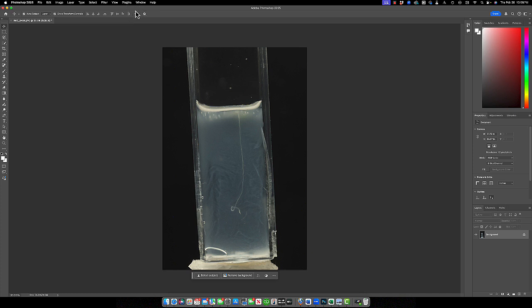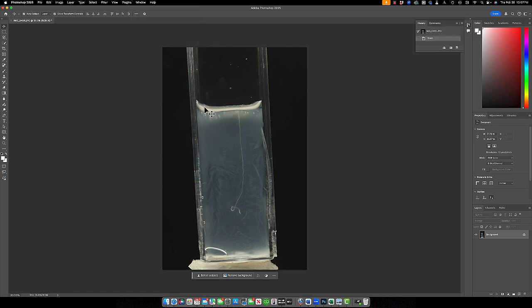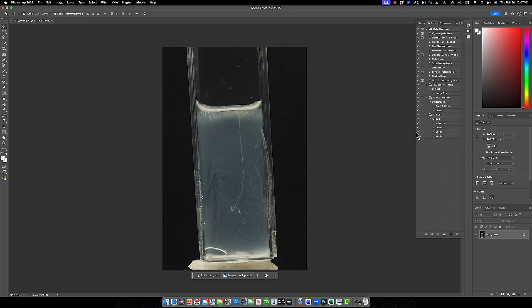that directory there. So what we want to be doing is recording all of our actions using a history function. So in here, I'm going to go to Window, and I'm going to activate the History tab. History is going to show us any types of edits that we make. We also want our actions to be found on here. And what we'll do is we'll create a brand new folder. This will be called Polaris Dawn Edits.